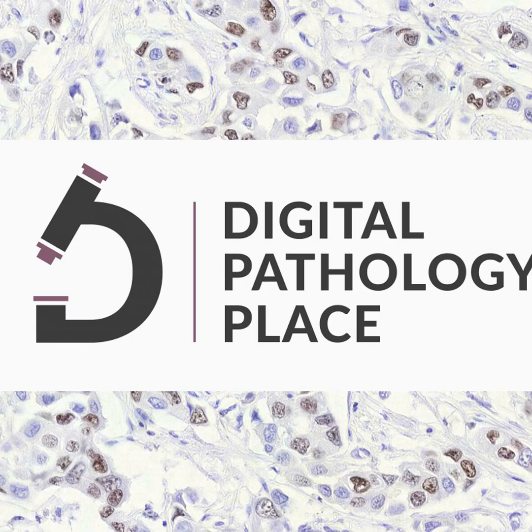I think super important and super simple thing you said, making sense out of this data, because having even the best perfect classification segmentation of the image doesn't guarantee that you will make sense of this data, and you can still make a mistake and have the wrong conclusions even if your image analysis is perfect. So I think you guys have the advantage of having the two-step approach within one team and taking the scientific question into consideration so that you actually answer the question and the whole analysis is tailored to answering this very question. This probably influences how you design it.